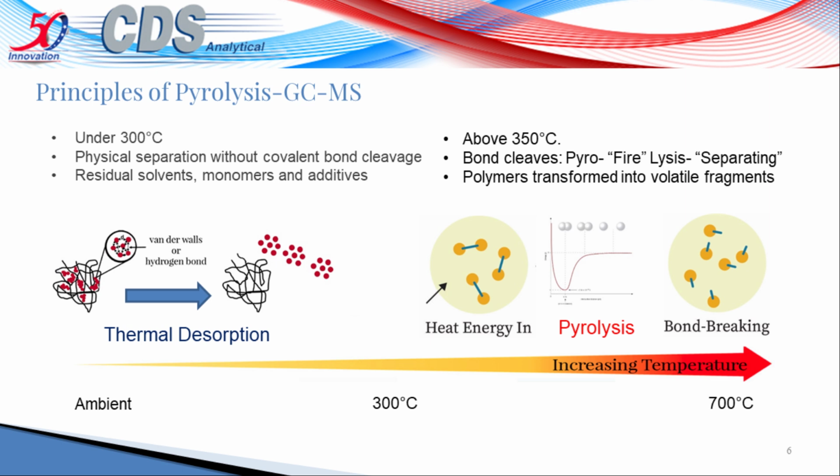Normally, you wouldn't expect GCMS to be a good way to study non-volatile materials like polymers, but pyrolysis works by using intense heat, intense enough to break molecular bonds, transforming polymers into a series of volatile fragments, also called pyrolysates, which can then travel to the GCMS for analysis.